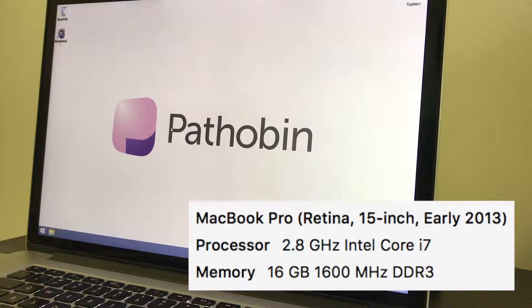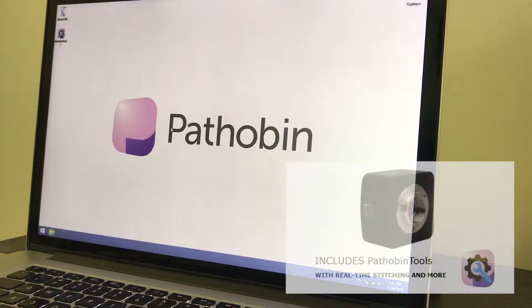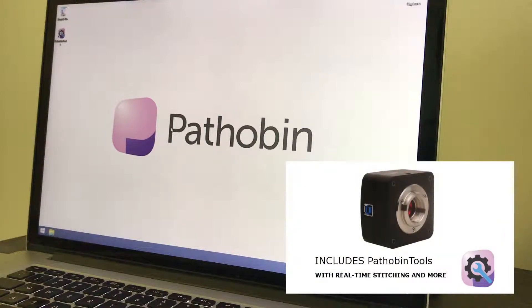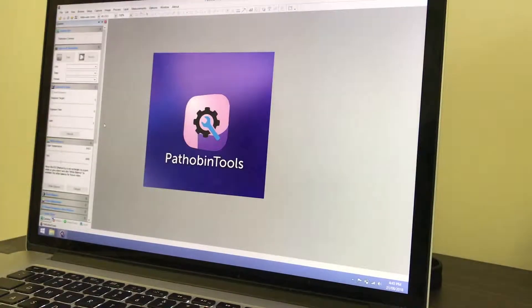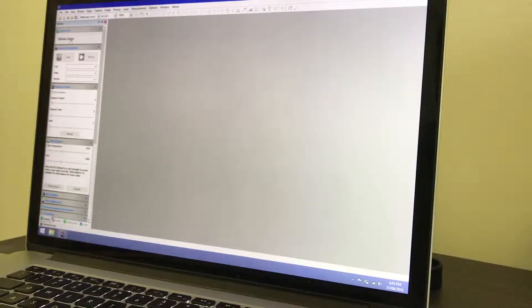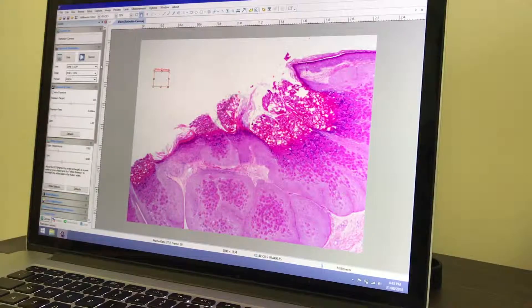Pathobin Tools is included free with the Pathobin USB-C mount camera, and it will only work with this particular camera. Once you've installed the software, you'll find a shortcut on the desktop. Double-click that and Pathobin Tools will open. Now select the Pathobin camera from the menu bar on the left and the live view will be shown.